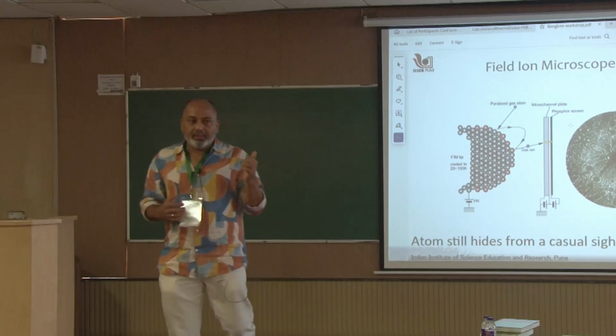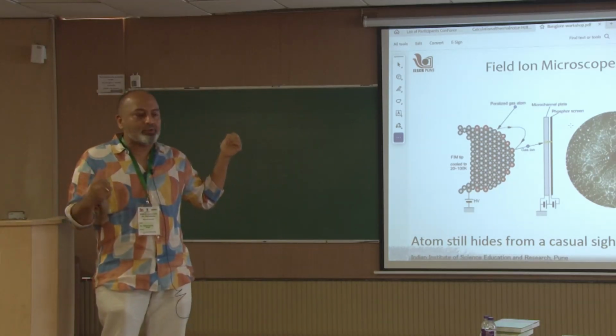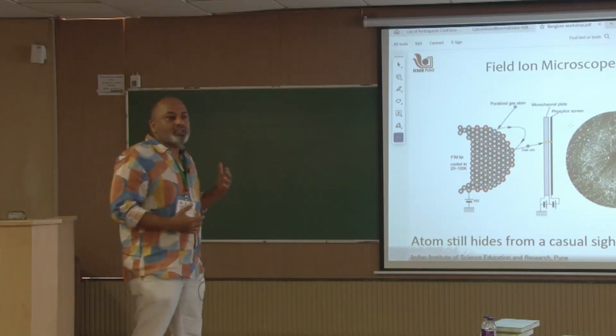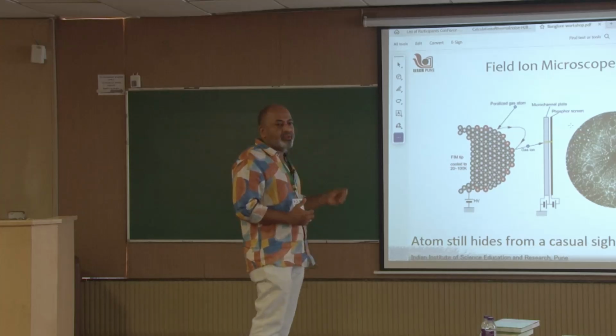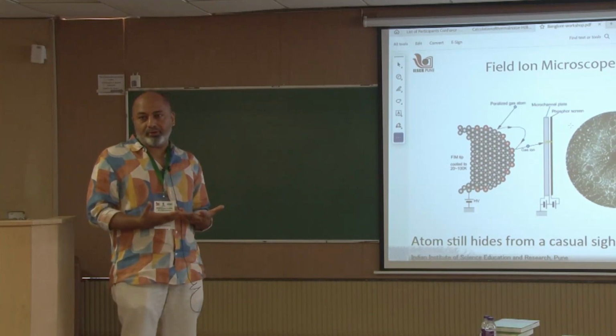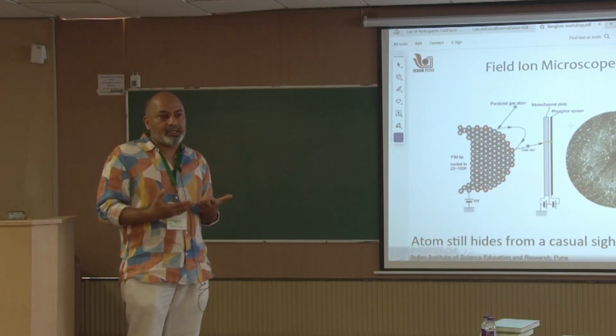And in electron microscopes, actually the scanning electron microscope, SEM, that we saw, such a tip is used as a source of electrons. If you have such a high field at the very end of the tip, you can strip electrons from that material, and that becomes the source of electrons. Okay, so that's the field emitted electron source.